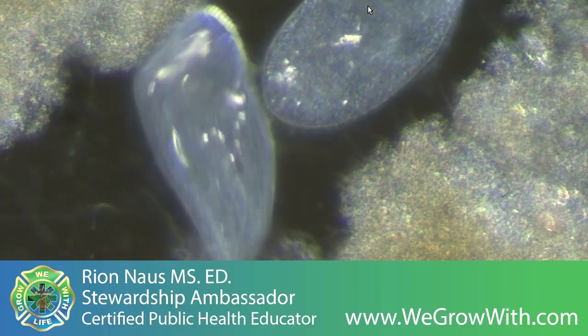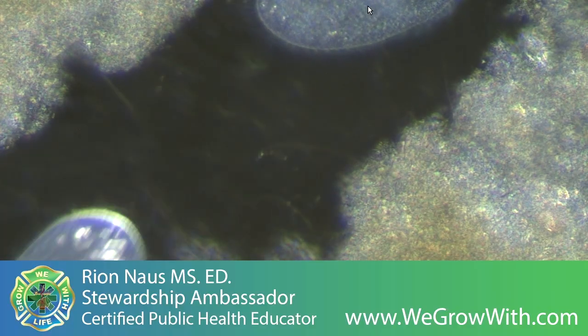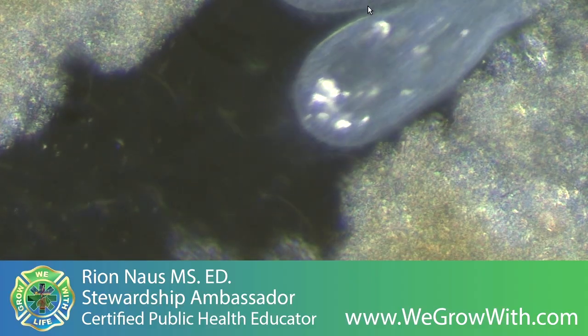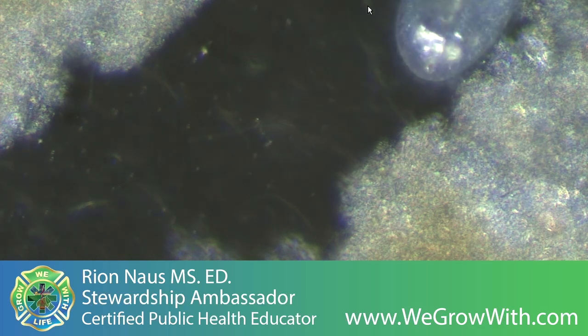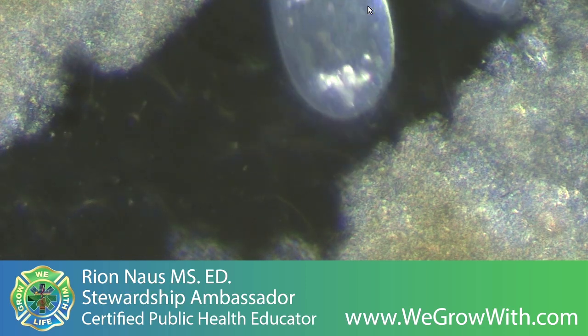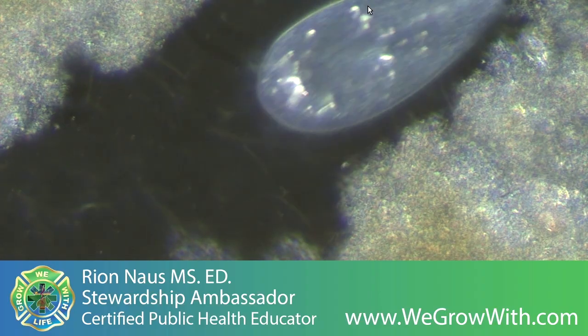Like a diver's bell. So inside, this has a higher partial pressure of whatever gases are dissolved in it as well. You can see all of the different bacteria swirling around it as it continues to seek refuge.